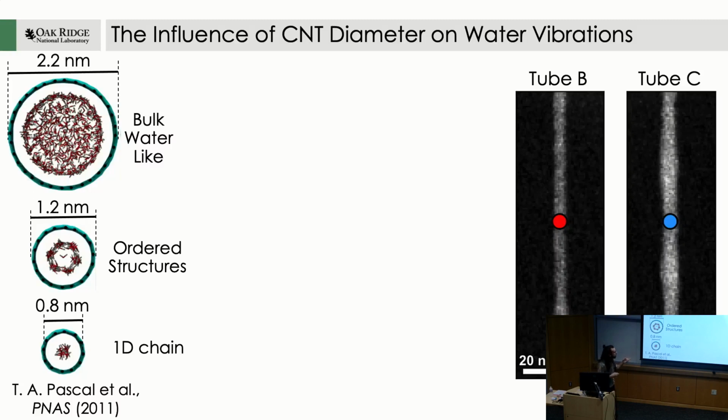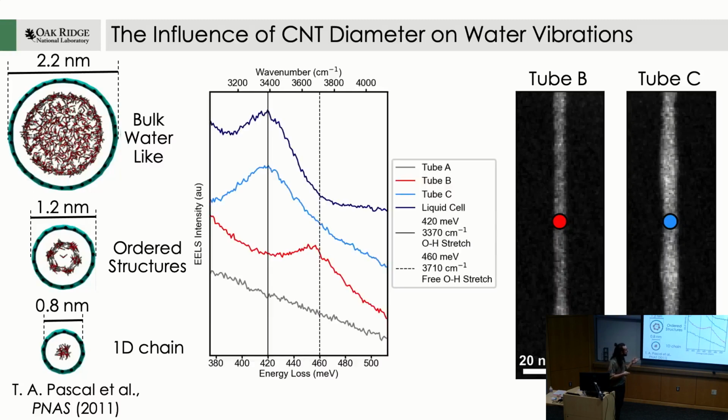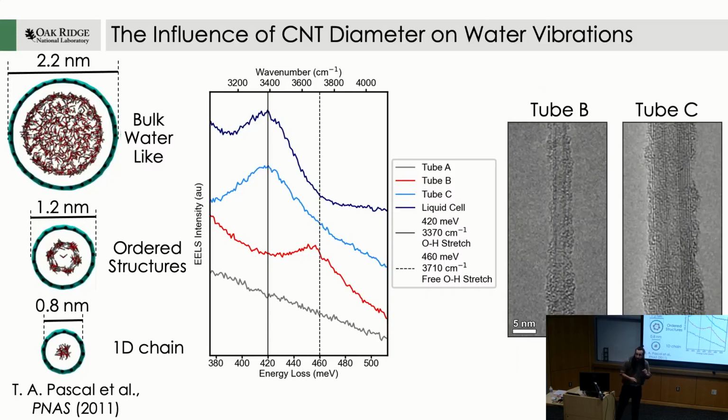So let's go back to these two tubes that had such a different response. Just to remind you that these are the two tubes. And then let's go into a bright field TEM mode where we're really sensitive to the inner diameter of that tube. And now that they're nice and sparse, we should be able to measure that. Here are the TEM images from these two tubes. And what you can't maybe see immediately is that the inner diameter of the one with the 460 meV peak is around 1.4 nanometers, and the inner diameter of the one with the 420 meV peak is about 2.3 nanometers.